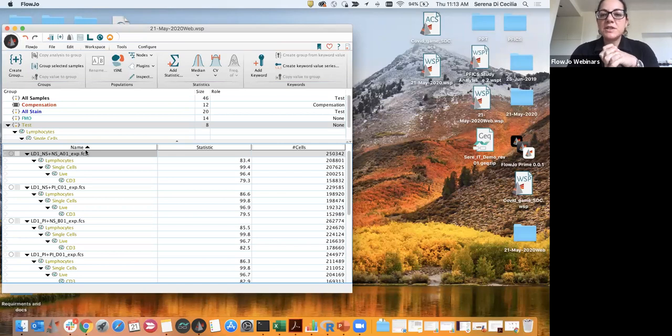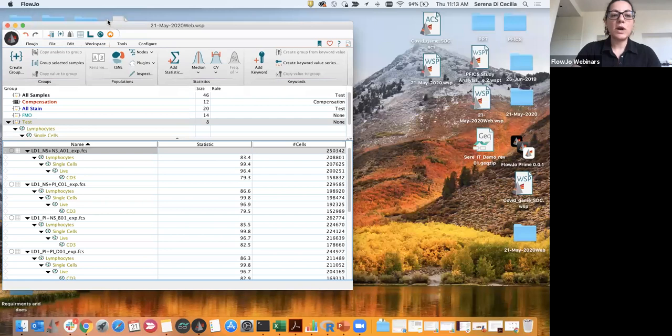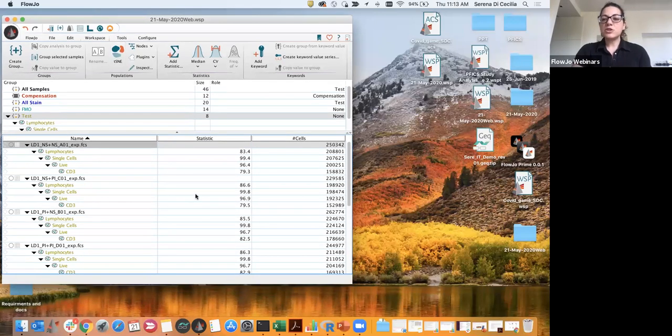So if you're interested in that, such as Flow AI and Flow Clean, you can check our previous webinar from May 7th that Christoph gave, and there is a super nice explanation of the quality check plugins. While for dimensionality reduction, we have different options. We can use, for example, tSNE, which is not a plugin in this case because it's built in the engine of FlowJo, so it's native and it's way faster than the plugin version.